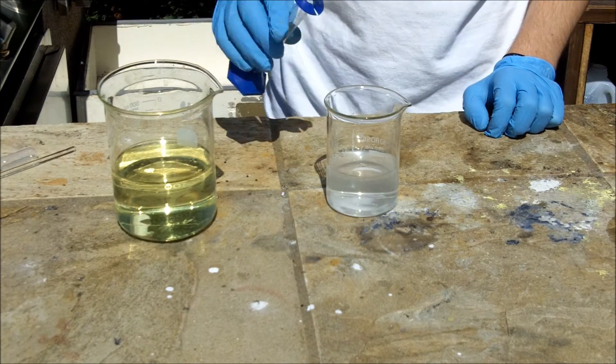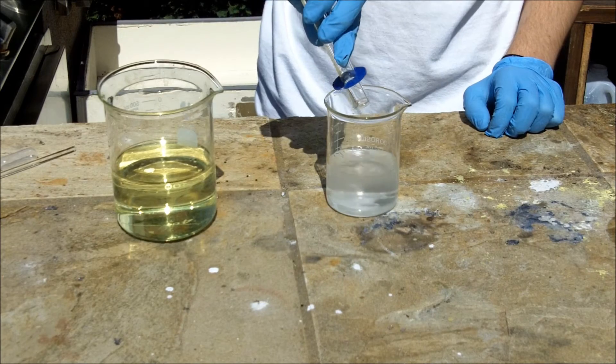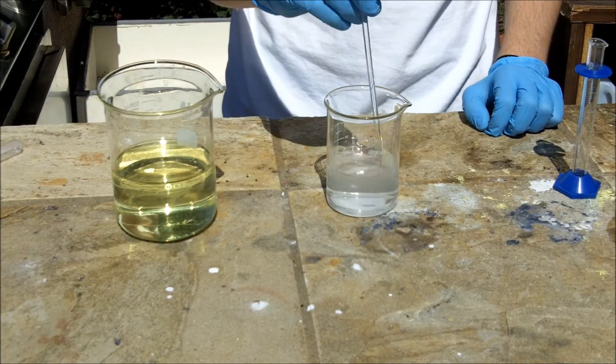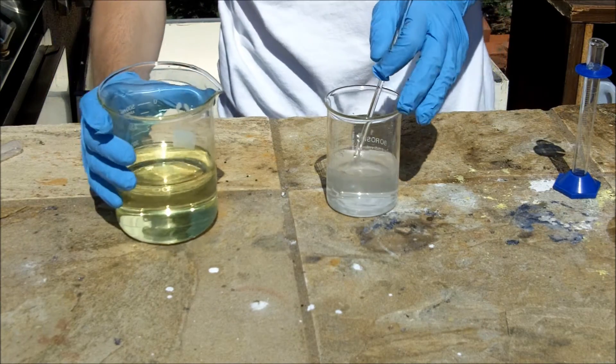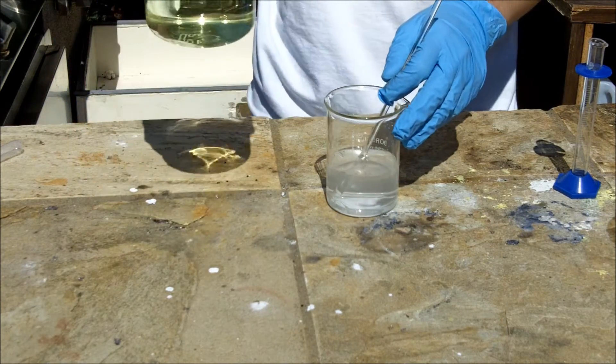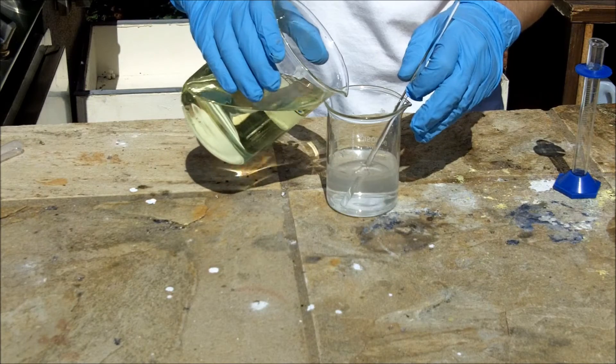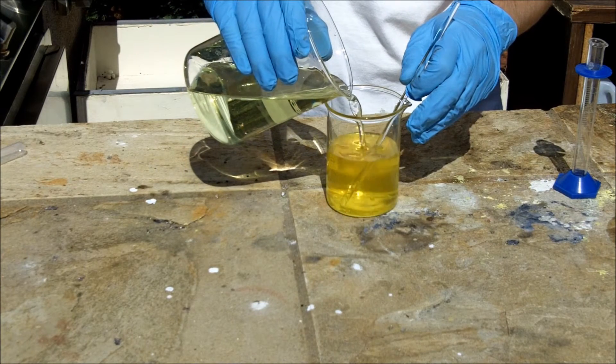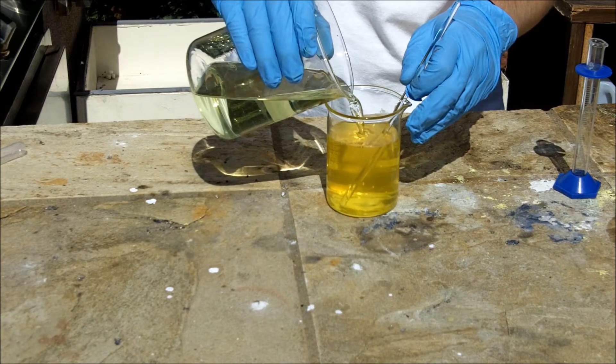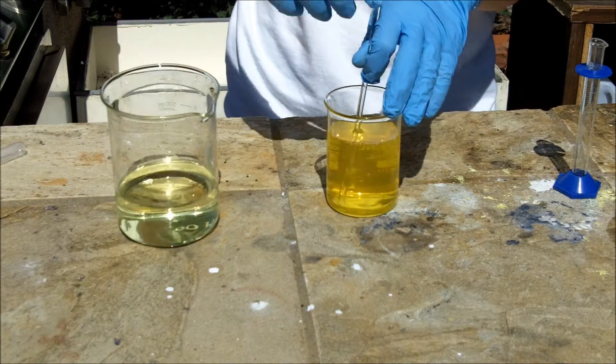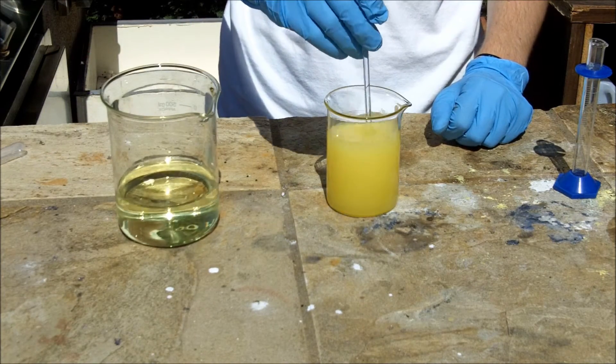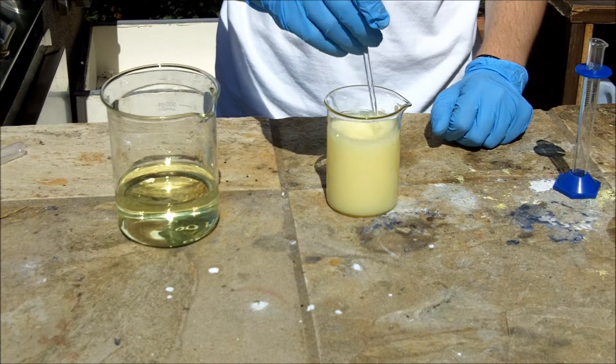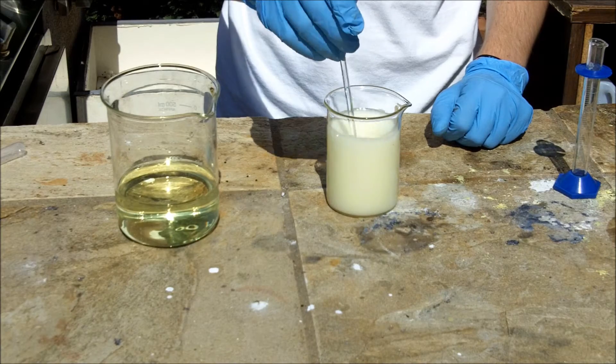Okay, so 4 milliliters of acetone. And now I will add in the 150 milliliters of bleach. We see an interesting color change there.